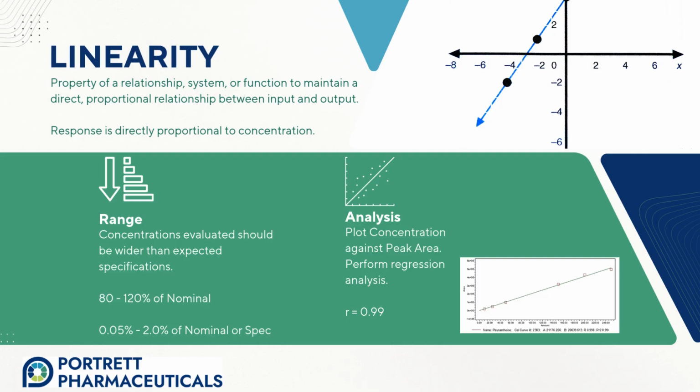Linearity is the direct proportion of the concentration of your analyte to the response of the detector. This simply means that if the concentration of your sample doubles, then the response obtained by the detector doubles as well. It is important to show this correlation for most methods used in pharmaceutical analysis, as the concentration or content is measured by some type of detection source.